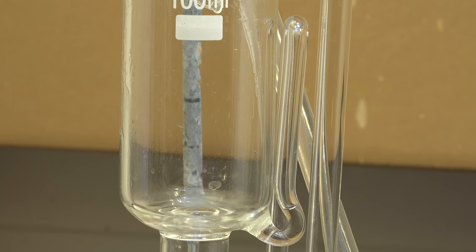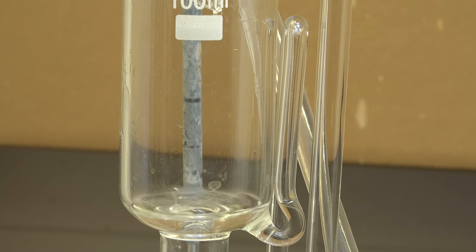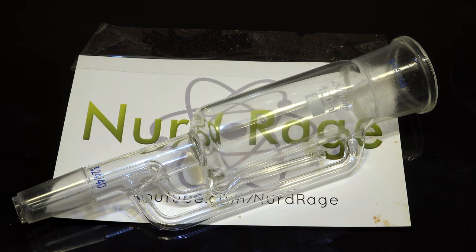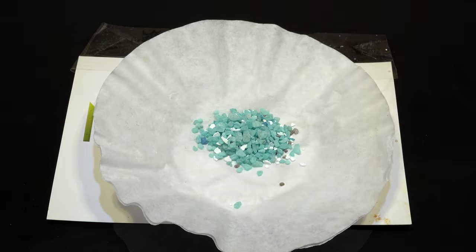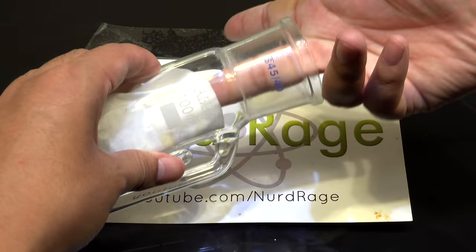It's even more common than the Dean Stark apparatus. Now so far, I've just been showing you an empty Soxhlet extractor so you can see how it works. To fill it, you need to remember to put your chemicals in some type of restraint, like filter paper, and make a teabag out of it. Then you can put it into the extractor.